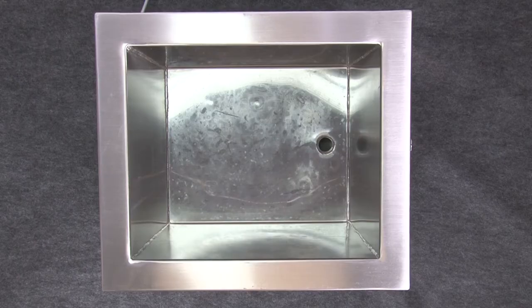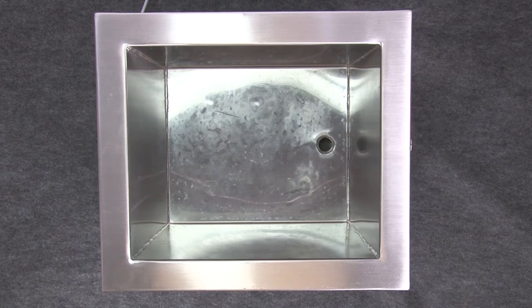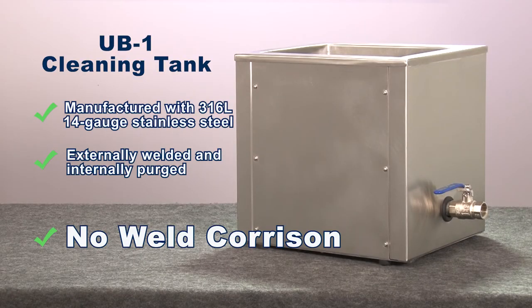The cleaning tank is manufactured with 316L 14-gauge low-carbon stainless steel, externally welded and internally purged for clean, corrosion-free, high-quality welds to guarantee the best possible welding result with no internal oxidation.